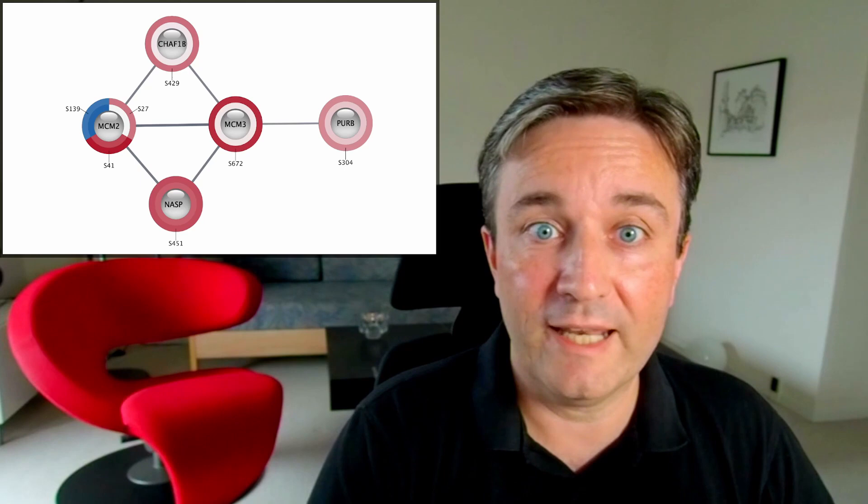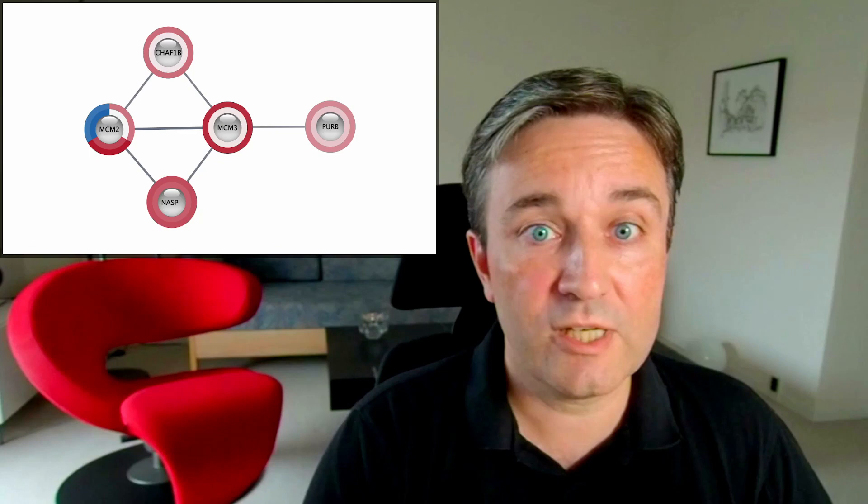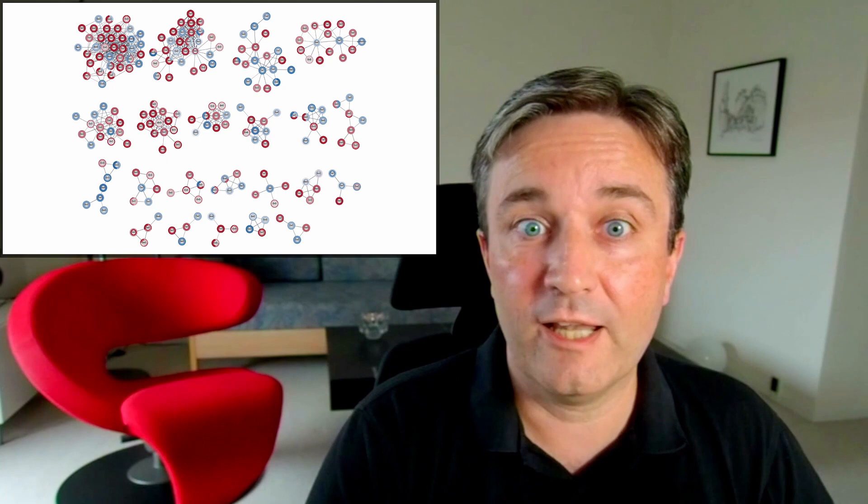You can also simplify this, since the labels are optional, making a network looking this way. You will typically want to do that if you want to visualize larger networks. You can imagine how it would look if I had put labels on every phosphorylation site.